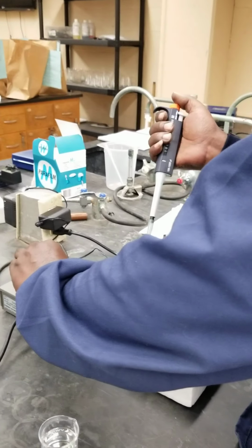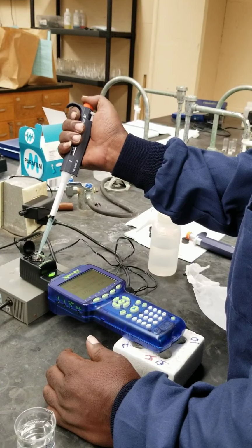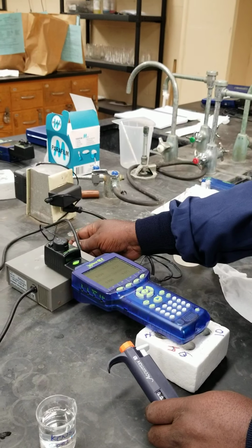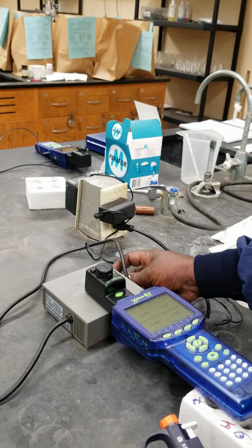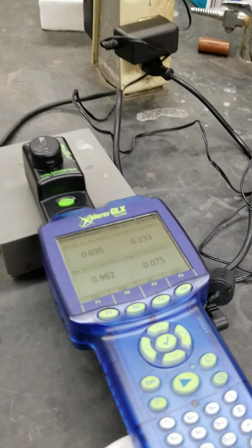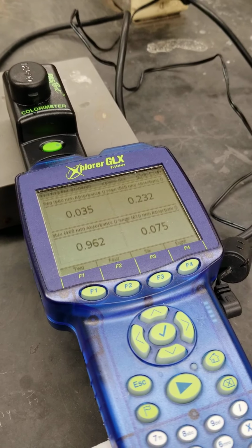Number 7. The absorbance value is 0.962.